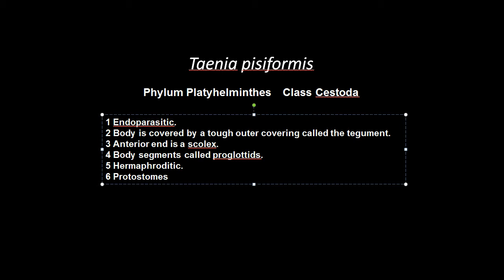At the anterior end is a scolex, which latches on to the inside of the host's intestine so that the animal can feed and acquire nutrients through diffusion.